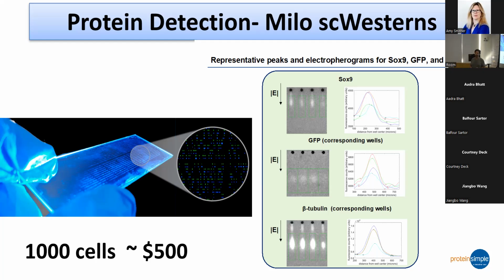Can you run multiple samples, or do you have to put the same sample on the whole slide? You can't. Actually, they have a new cassette that you can lay over this entire slide that allows you to do multiple samples. We have not used that yet, but I think you can do up to 2 samples per slide. I'm not sure on that. You'd have to look on the webpage because it is a newer technology.